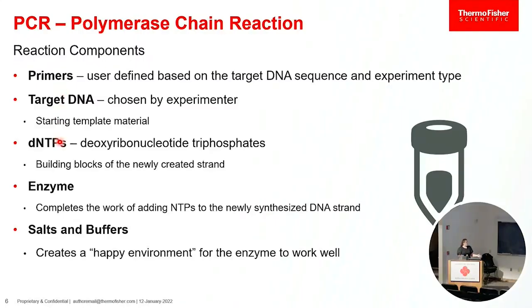The more universal pieces are dNTPs, and those are the individual singular nucleotides that we're going to build onto the primer to create that sequence we're interested in. So they're nucleotide triphosphates, and they're usually in a mix. Like I said, it's the building blocks there.